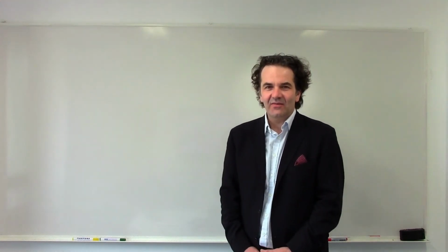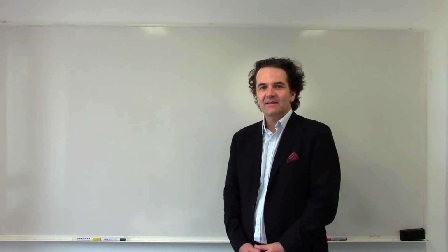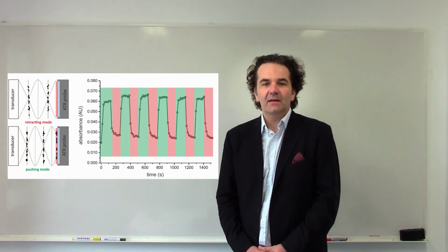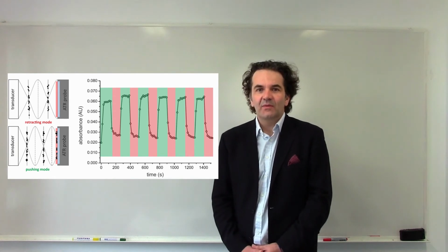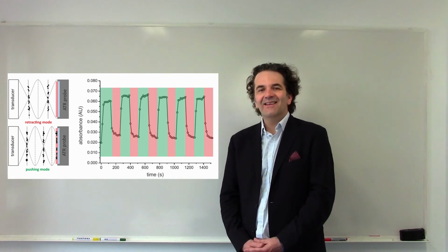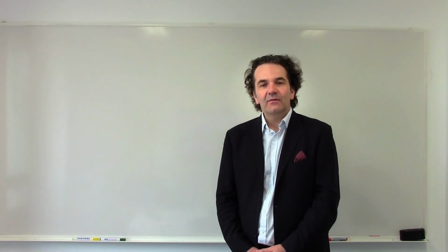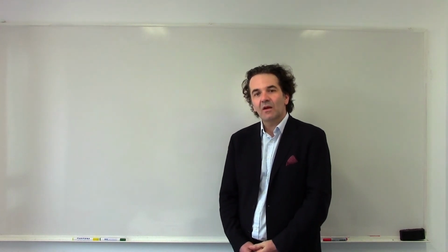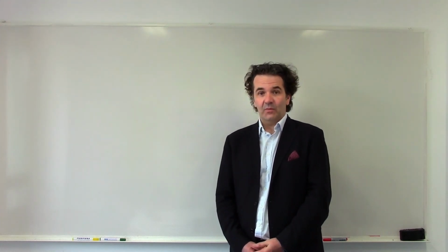The application of ultrasound with the ATR, infrared spectroscopy, is an application that plays around with frequency. In this case, the particles are kept about half a wavelength from the ATR. Now, when we change the frequency, particles are pushed closer and closer to the ATR until they populate the evanescent field. Now, if you think of the information-rich mid-IR, the fingerprint regions, you can take measurements of cells in line, real time, in this case, the yeast cells in the process.